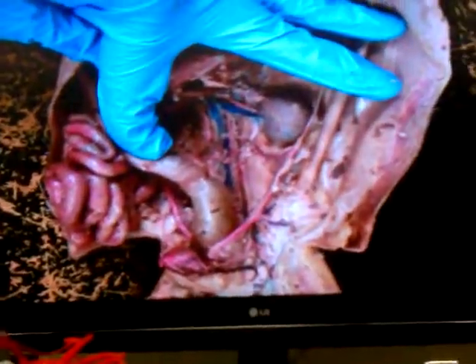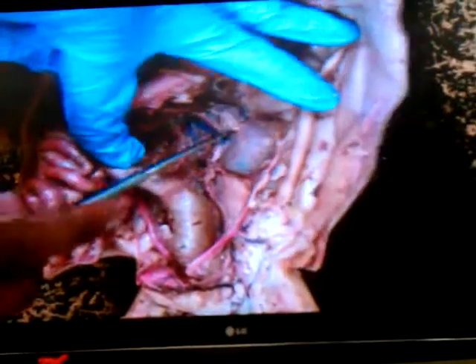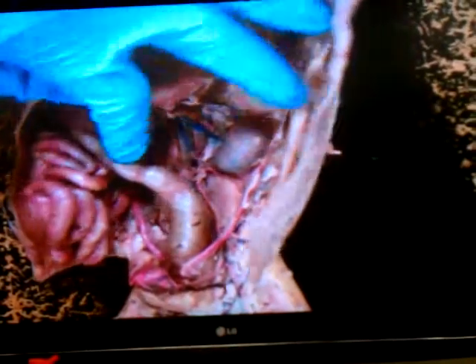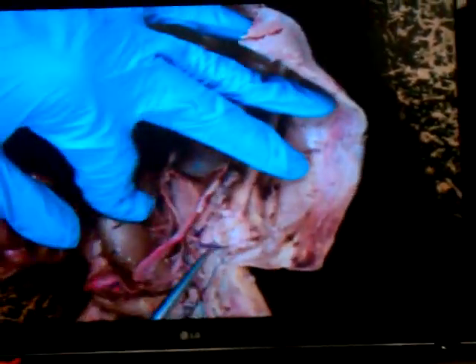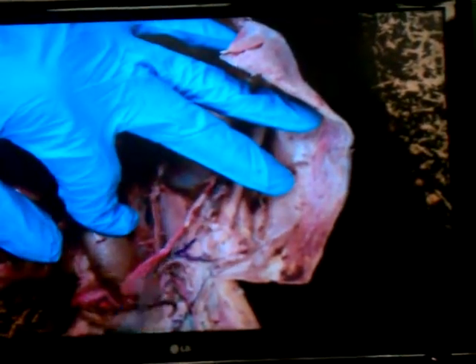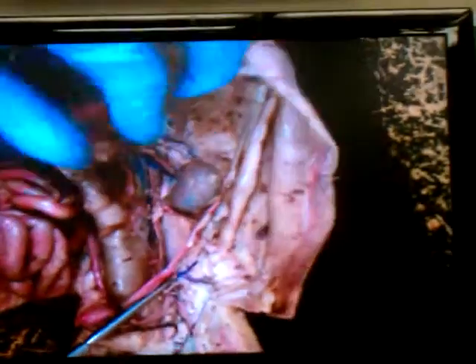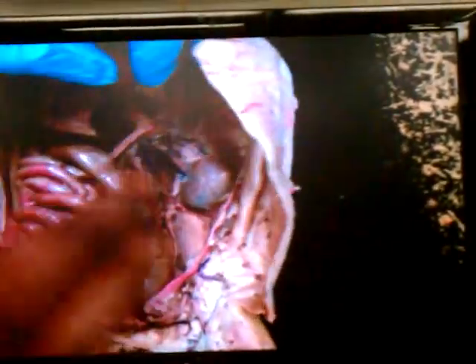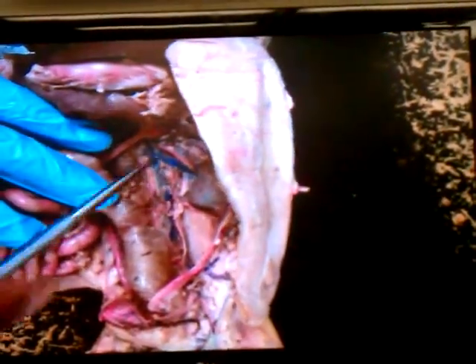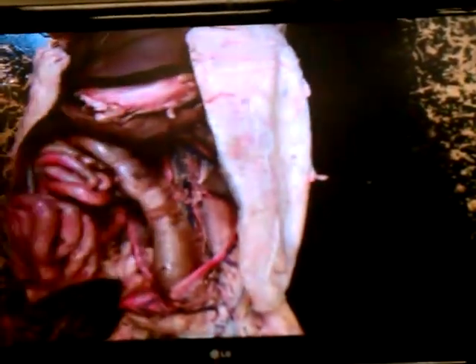That's renal vein. There's going to be a vein, Mr. Gilmore, that's right above. The adrenal lumbar. Adrenal lumbar. If that's adrenal lumbar, Mr. Gilmore, I notice there's a vein down here. That's iliolumbar. If that's iliolumbar, Mr. Gilmore, if I was to tag this right here, what would this be? That's still got to be inferior vena cava, right? If that's inferior vena cava, Mr. Gilmore, watch this right here.